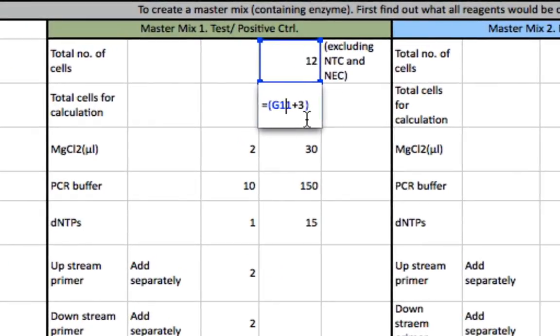Every time when you are adding liquid, there is some amount of pipetting error. You may be adding a little less solution or a little less reagent every time, right? Second, when you are using plasticware and dealing with very low volumes of liquid, many times liquid just sticks to the walls of the plasticware, and eventually for the last tube you will find that your volume is a little less than what it should be.